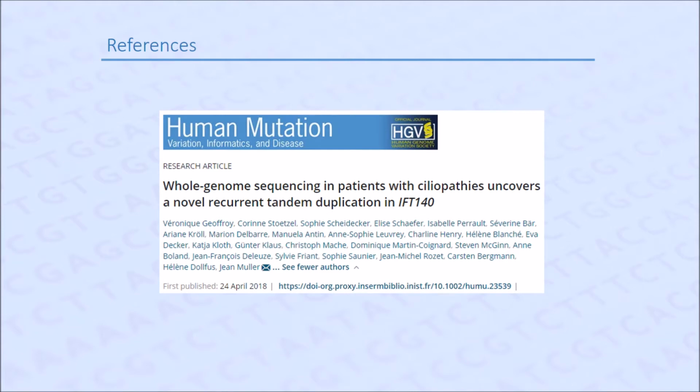This video is based on data extracted from the following publication, Whole Genome Sequencing in Patients with Ciliopathies, and covers a novel recurrent tandem duplication in IFT140 that was published in 2018 in Human Mutation.